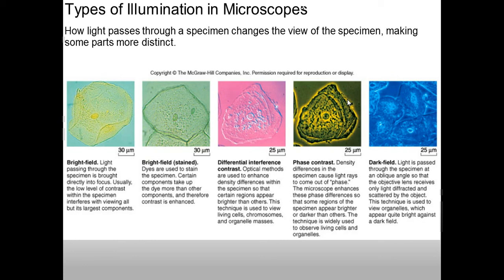All of these are microscope images of, it appears to be, cheek cells. And you can see if you change the light, it makes the cheek cell appear different, and then you're able to see different parts of it.